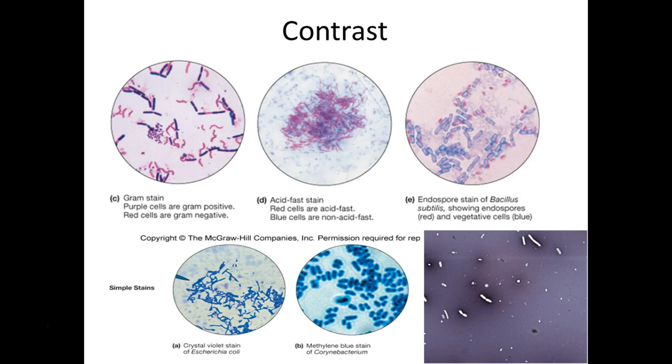There are gram-positive and gram-negative. And they stain these different colors because of the two different dyes that we use, crystal violet and safranin, which is a reddish dye. This is probably the most common staining procedure done in a microbiology lab, and you will do it in lab in the next couple of weeks. We're going to talk about this particular procedure today in excessive detail.